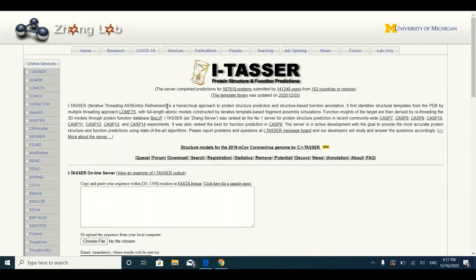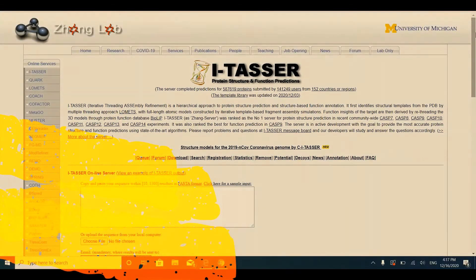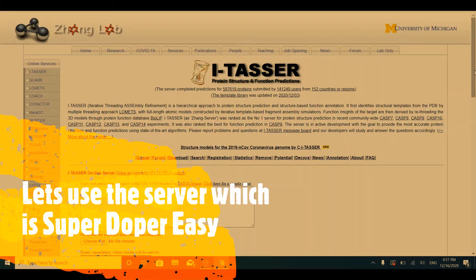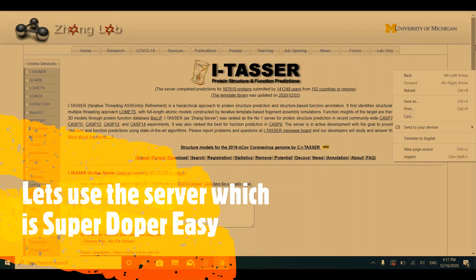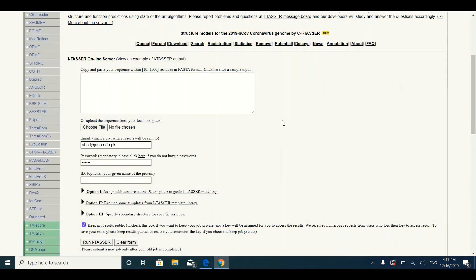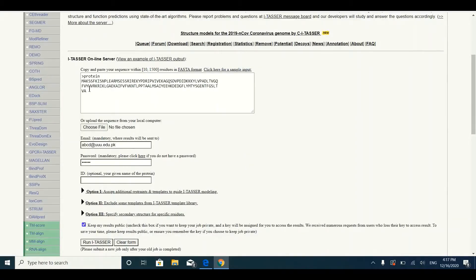We highly recommend you to use I-TASSER. The use of I-TASSER is very simple — you simply need to copy and paste your protein sequence into the input box, and then you have to provide some credentials like your academic email ID and a password.